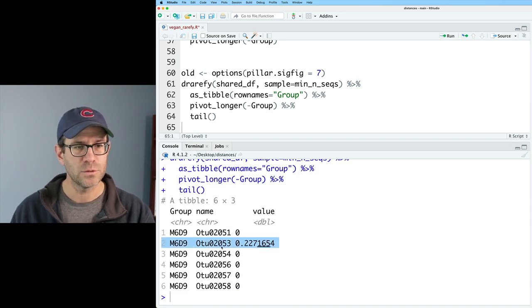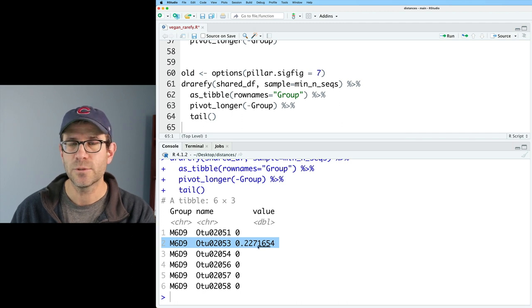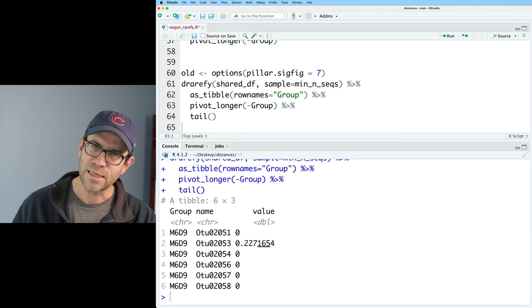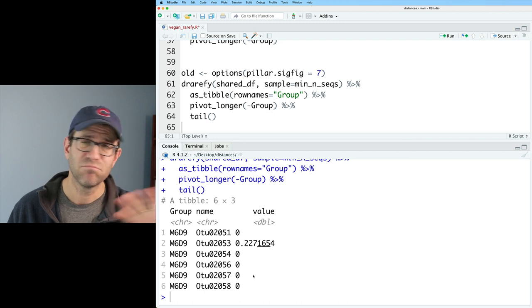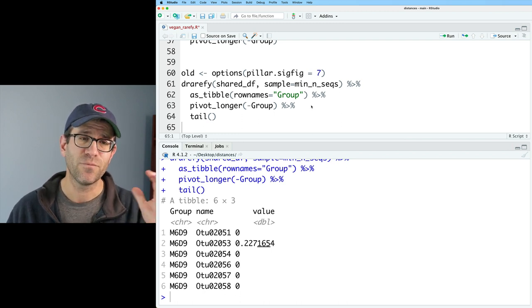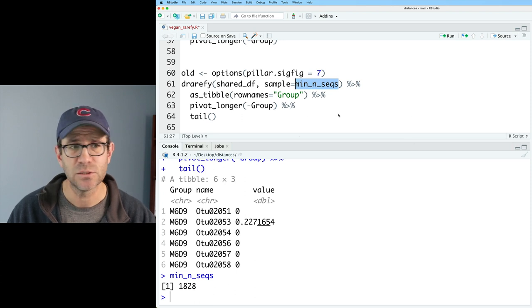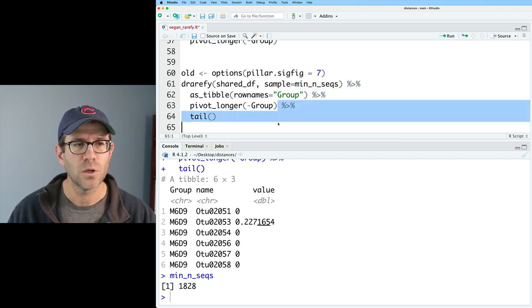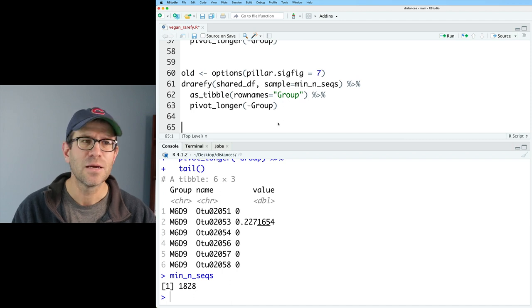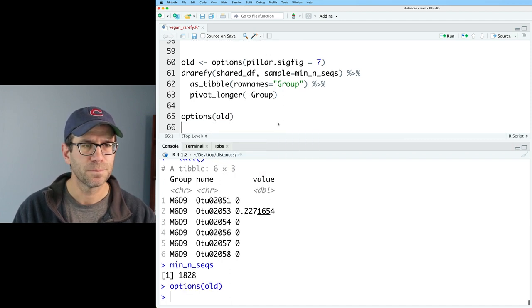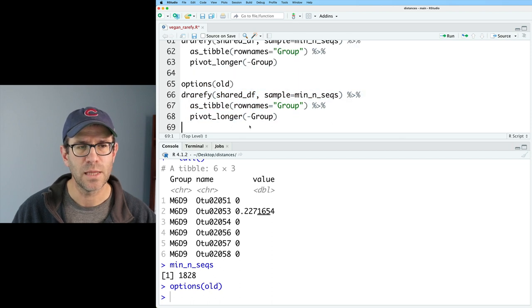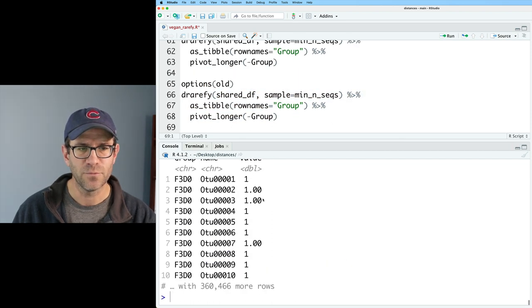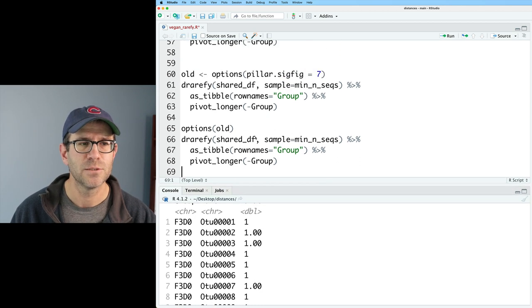And so you can see that otu2 is pretty close to, you know, dead on that we're going to see otu2 when we get min_nseqs, right? And so if I perhaps looked at the tail of this, we would see that sum, you know, this otu2053 has about a 23% chance of being seen in sample m6d9, whereas these other taxa, we're not going to see them ever really, if we sample to min_nseqs, which again was 1828. Cool. So if I want to go back then to the default, then what I could do is options old. And now if I rerun this, we'll see that we go right back to what we had before, which was three significant digits to the right of the decimal place.